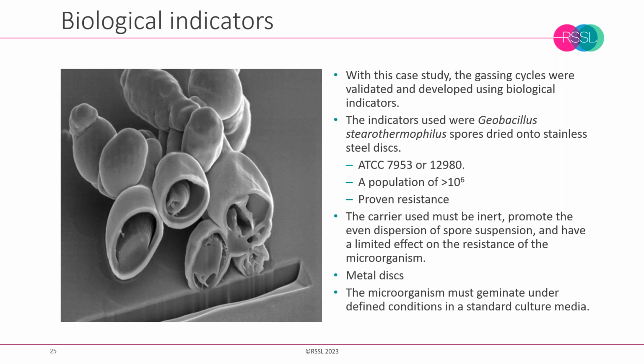Now, there is some debate about whether the discs should or should not be in Tyvek pouches. So the advantage of Tyvek pouches is that it facilitates the placement and helps against cross-contamination, but the presence of Tyvek, which is a form of polyethylene fibre, can also create an additional barrier. So there's a choice to be made, and there are two schools of thought on that.